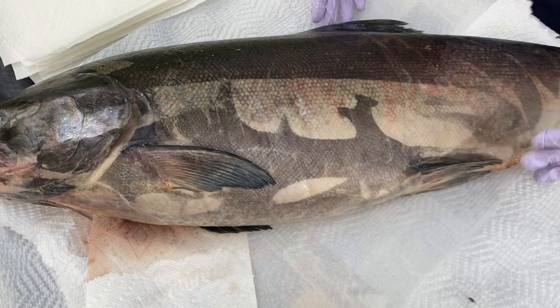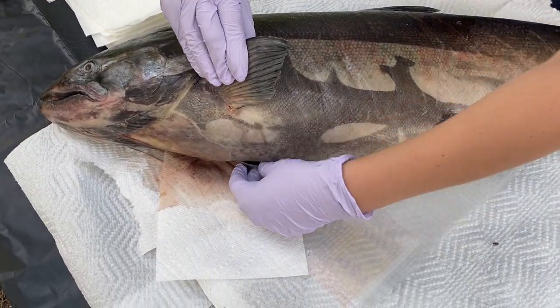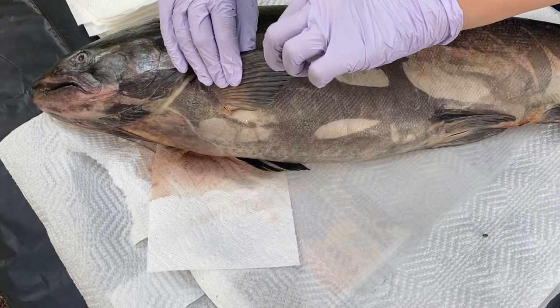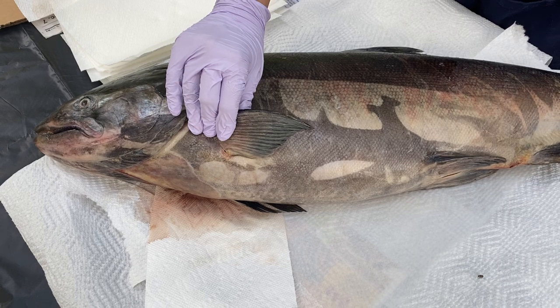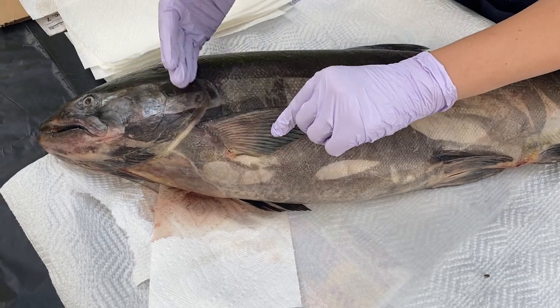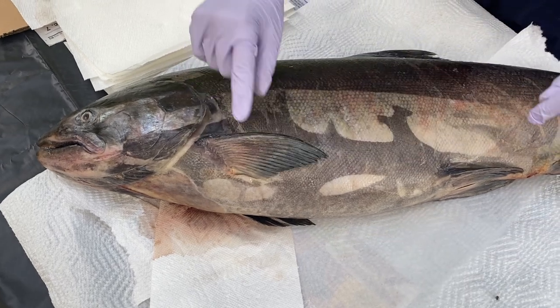And then we'll go over some of their fins. So the first fin up here, they're going to have one on each side. This is going to be the pectoral fin. And if you think about humans, our chest muscle is called our pectoral muscle. So if you think about a fish like a human, it's where their shoulder or chest was. So this is going to be their pectoral fin.